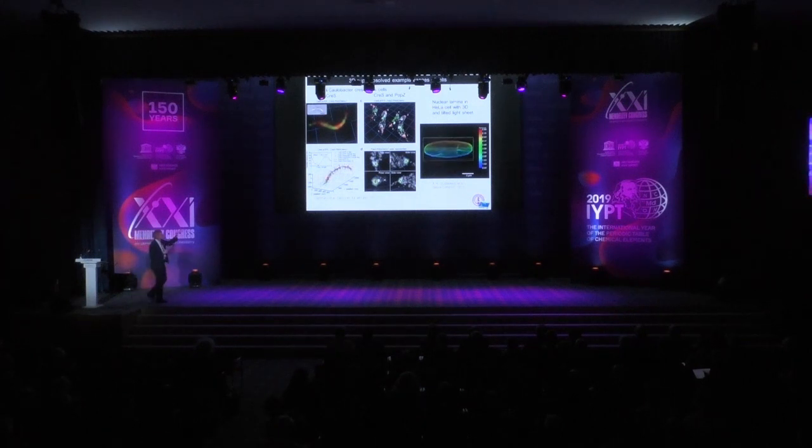Right inside the nuclear membrane is the lamina. This is a 3-dimensional super resolution image of the lamina, where you can even see a channel from one side to the other of the lamina itself at super resolution.